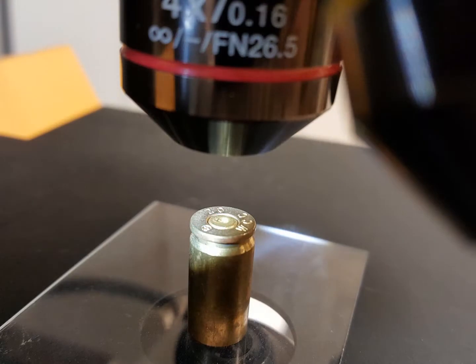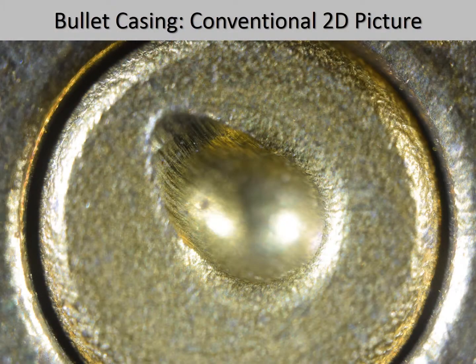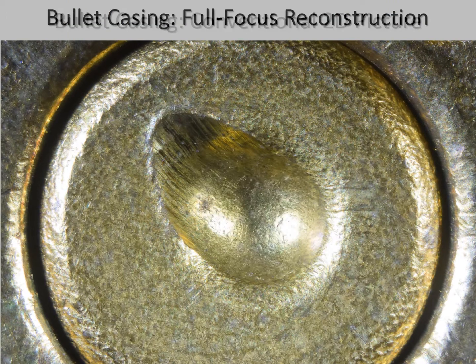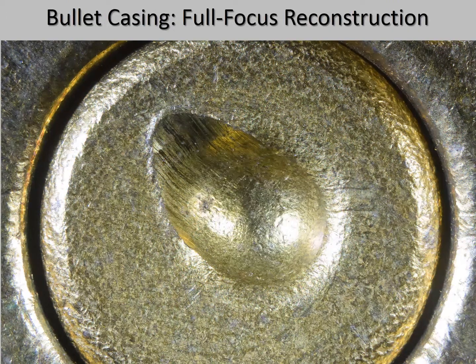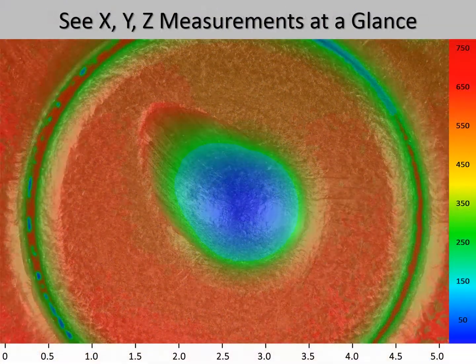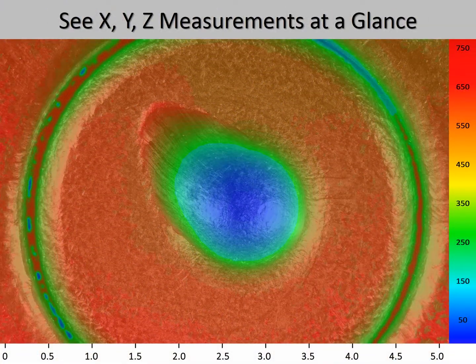Let's look at the shell casing of a bullet with the EDGE 3D Microscope. This is a conventional two-dimensional image of the end of the bullet casing, and as we can see, only a small portion of the image is in focus. Compare that with the full focus image produced by the EDGE 3D Microscope.